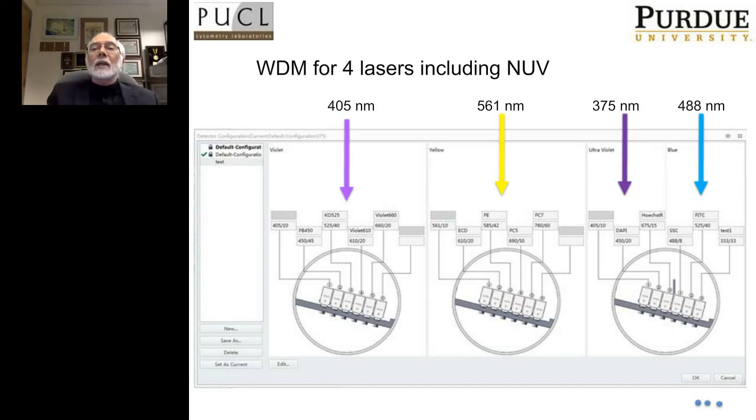But on the right-hand side, we have this split WDM module. You can see that the light coming from the excitation of two different lasers is coming into a split WDM. And where the red circle is, that is the WDM module that is now split. And a couple of things you see here: there are some blank spots. Where I've got two red arrows, there is no signal going to those detectors.